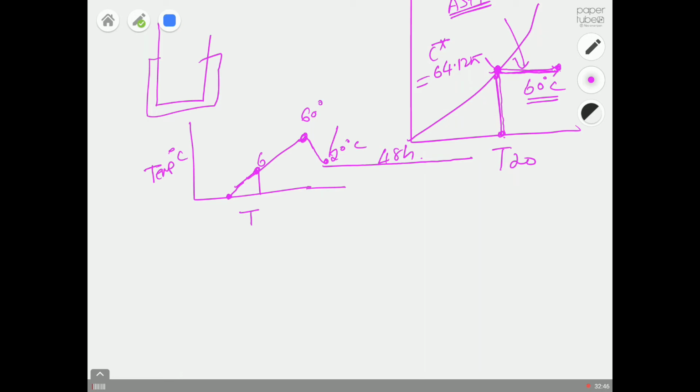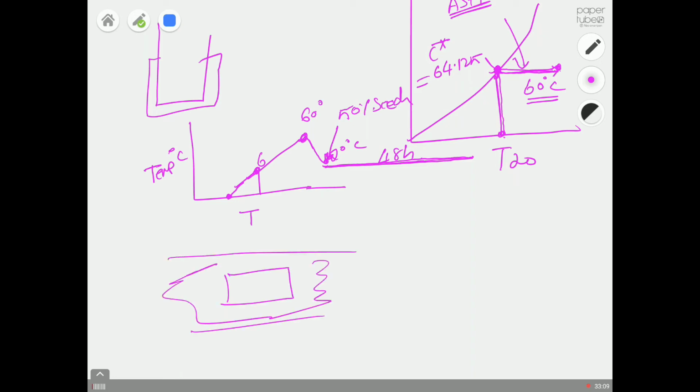So once you reach the 20 degrees centigrade, I seeded the crystals. In the first experiment, I used 50% seeds, and then that's it. I maintained the temperature at 20 degrees centigrade, and then the crystals are going to consume your supersaturation, and then they are going to grow. So what really happens is, if this is your crystal, this is your supersaturated solution, the paracetamol from the solution will move to the crystal, and then it will start to grow.